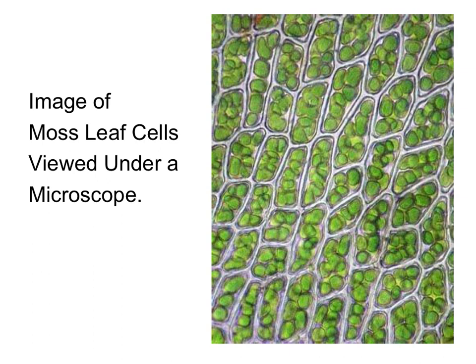We can see our cell walls really clearly, those divisions between the cells. But you can see there are some green structures in these cells, and those are what we call chloroplasts. And again, we'll spend a bit more time looking at what chloroplasts do in a later lesson. But chloroplasts are little structures within a plant cell that actually make the plant green. And they contain a pigment called chlorophyll, which traps sunlight during photosynthesis. And that's why plant cells can do photosynthesis, whereas animal cells cannot.